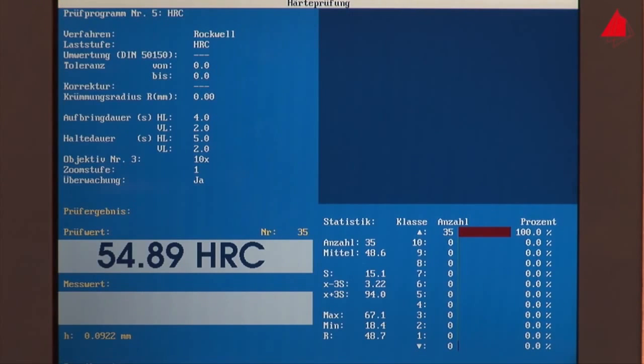That's it. The Rockwell hardness of our gear wheel is 55 HRC. This result is displayed on the screen.